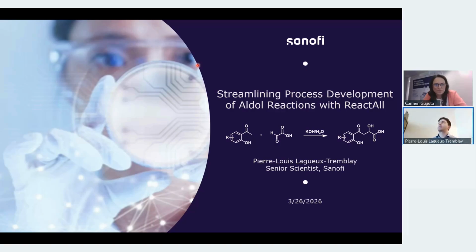Yeah, I mean, it's a very interesting question. So typically, back in my former research, we would always do kinetics. Sometimes not necessarily in a very special way. You have your typical reaction flask, a round bottom flask. It could be an NMR tube. So sometimes you can do kinetics in an NMR tube, but then you need a very expensive NMR machine, and changing temperature can be very complicated.